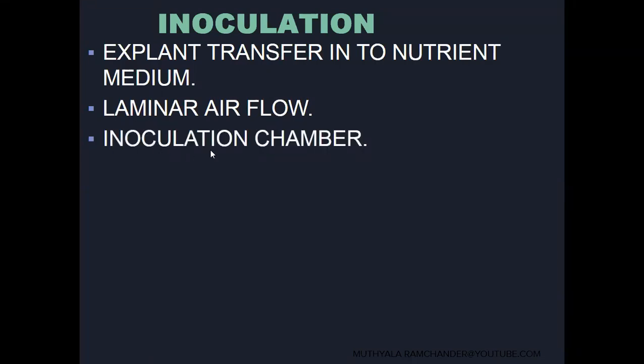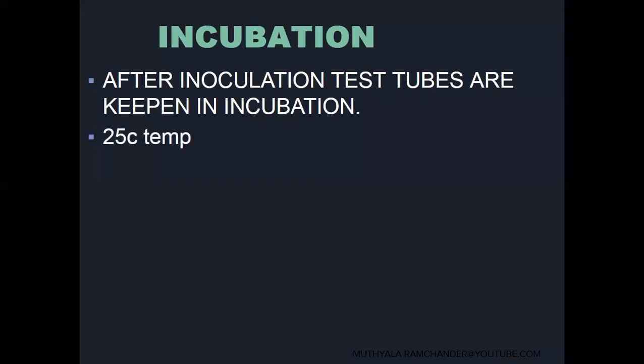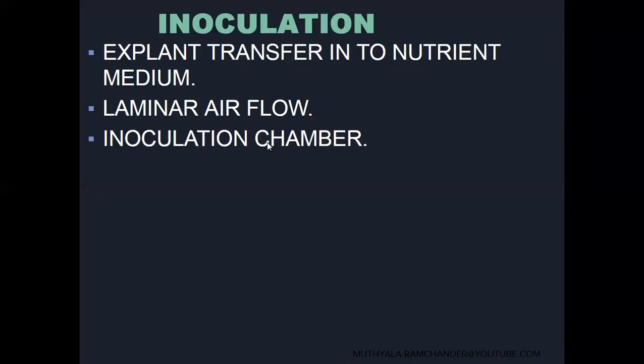They are also called inoculation chambers. In the inoculation chamber, UV lights and aseptic conditions are present. The sterilized explant is transferred into the sterilized nutrient medium with the help of laminar airflow under aseptic conditions.